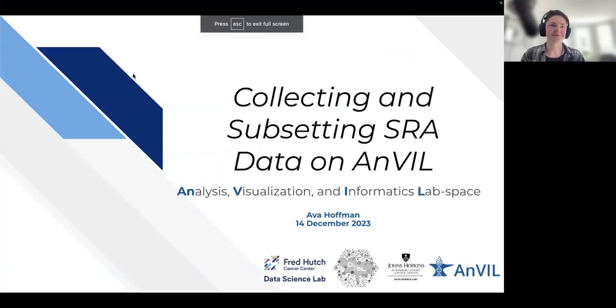All right, so really excited to talk to you about a couple of these quick tools today. So two topics we'll cover. First, collecting data from SRA, the Sequence Read Archive, and subsetting or downsampling that data on AnVIL.